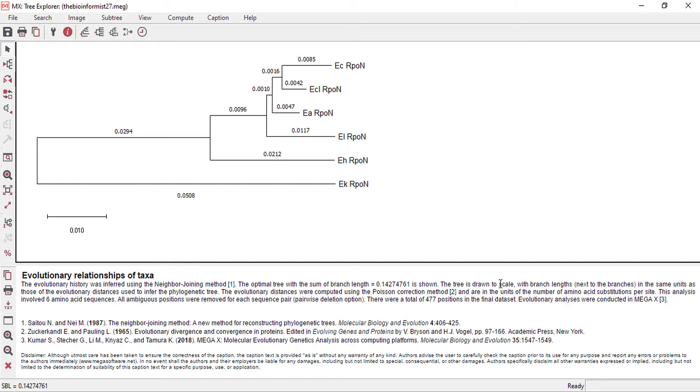The tree is drawn to scale with branch lengths next to the branches, the same unit as those of the evolutionary distances used to infer the phylogenetic tree. After tree construction, we can play around with the tree.